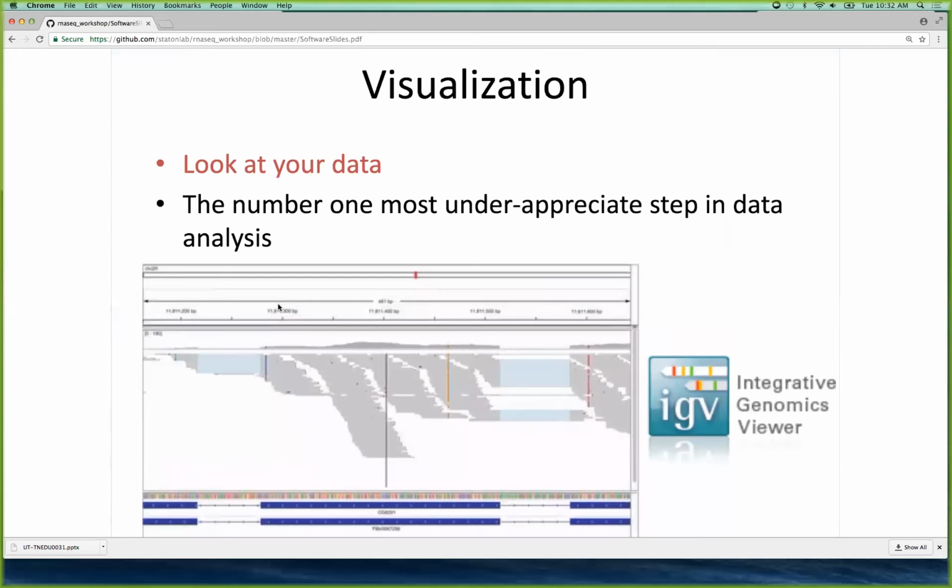And also you can see if the splice sites are like you expected, or maybe you may have some isoforms, so you will see some mappings on regions where they were supposed not to. Sometimes it might happen that you have coverage only on one part of the genes, not all of that. This is mostly for visual inspection of your results after mapping.